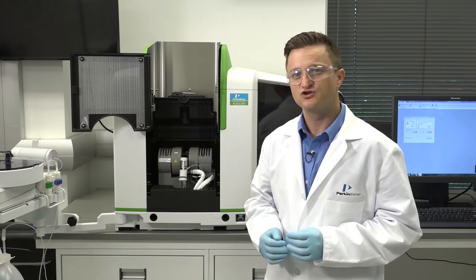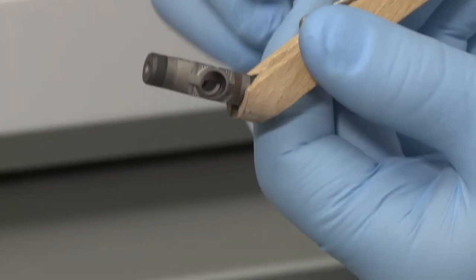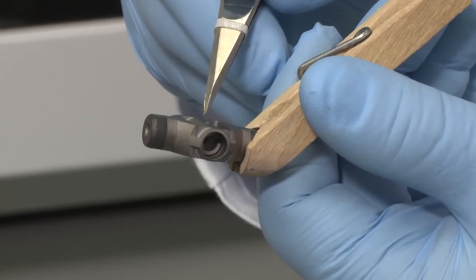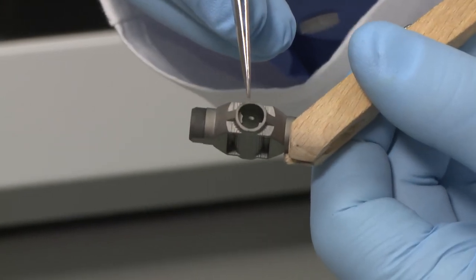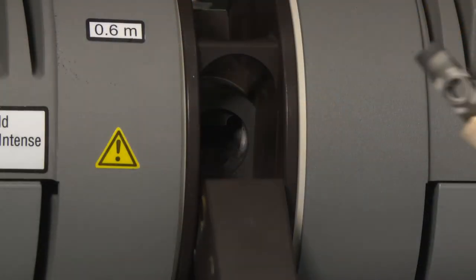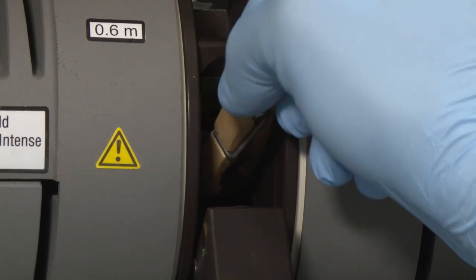Now that the original tube is removed, you can insert a new graphite tube. When you insert the graphite tube, make sure that the sample injection hole is on the uppermost side and the side of the tube to which the platform is attached faces to the back of the furnace. The platform is then higher toward the rear. Once the graphite tube is positioned correctly, use the insertion removal tool to insert the graphite tube into the rear contact.